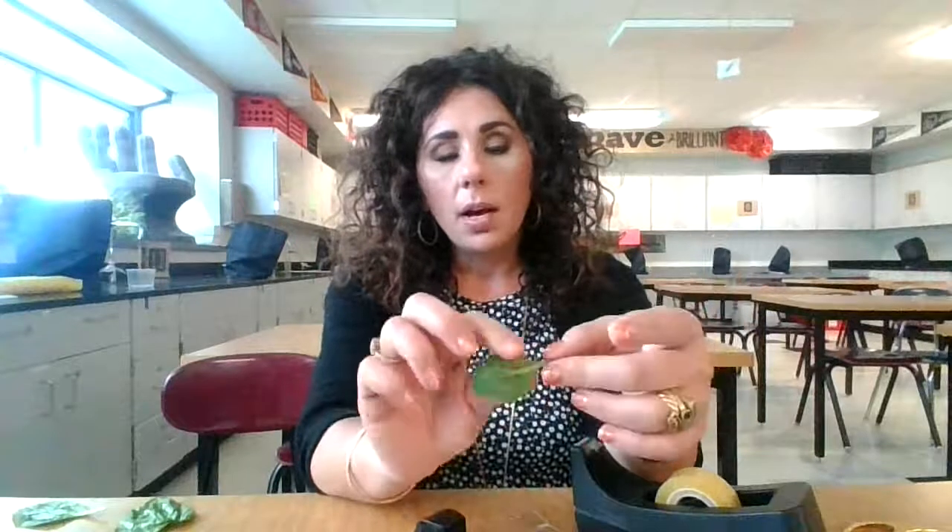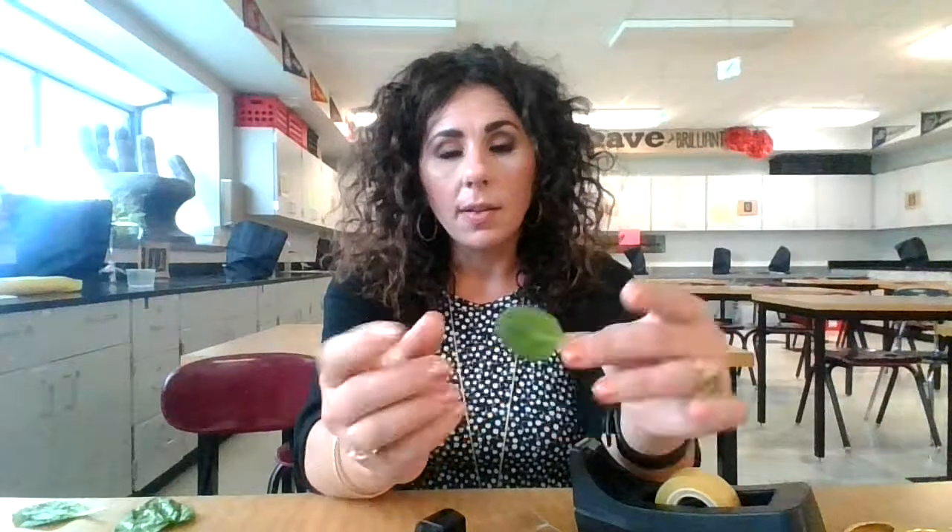All leaves have a layer of cells on the outside called an epidermis, and it's kind of like our skin. These cells have specialized structures that help them obtain the carbon dioxide that they need to go through the process of photosynthesis.